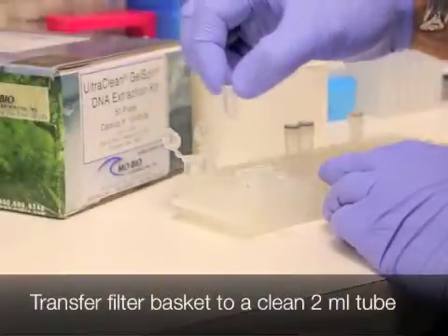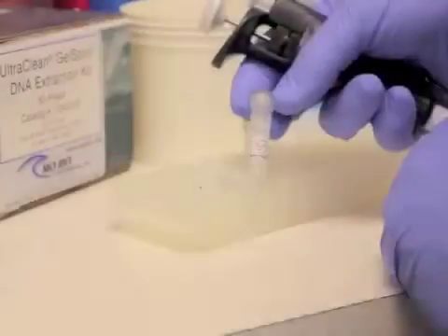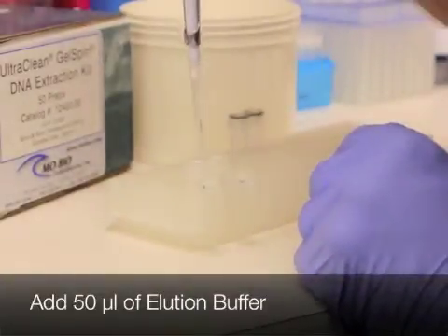Carefully transfer the filter basket to a clean 2 ml collection tube. Add 50 microliters of elution buffer or water directly onto the center of the white spin filter membrane.